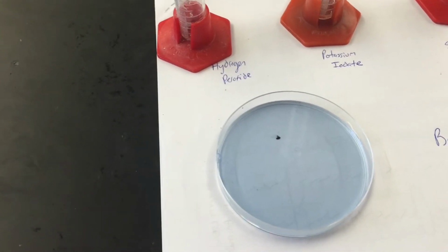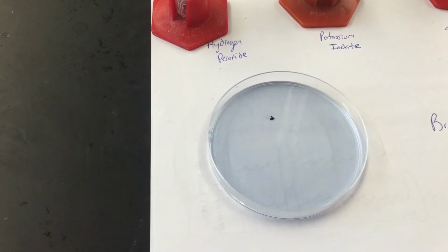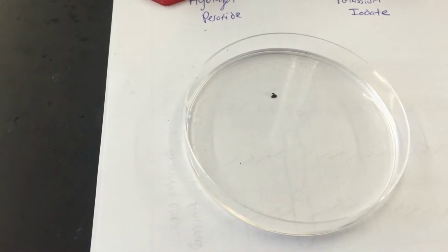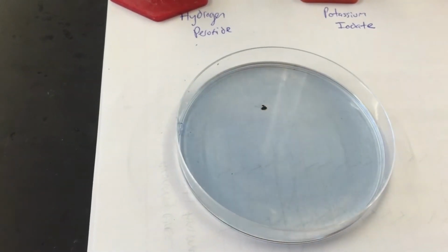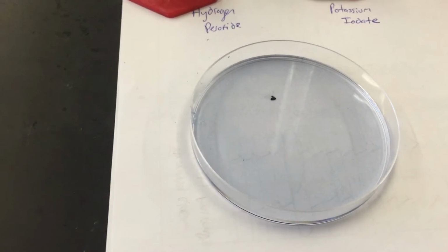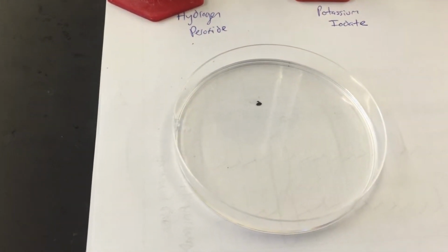So as you can see, it's actually fading into blue. And you can barely see. So now it's going back to that blue color. And then it goes back to being kind of this yellowy color.